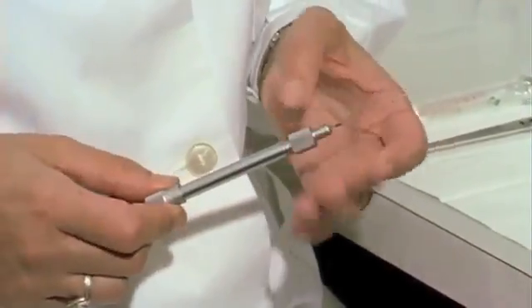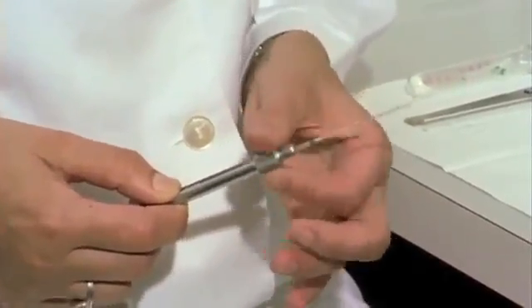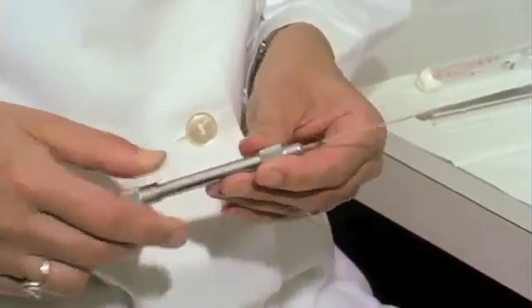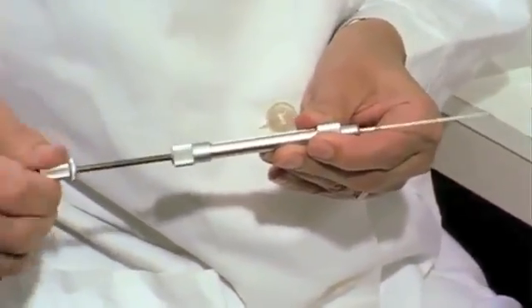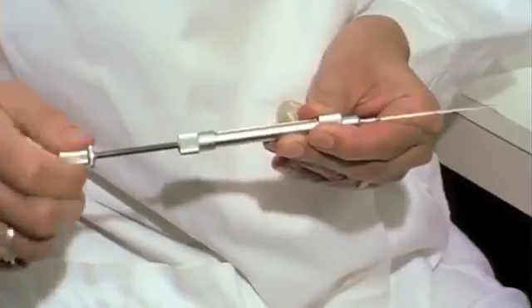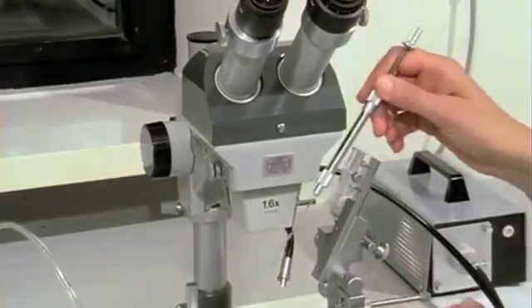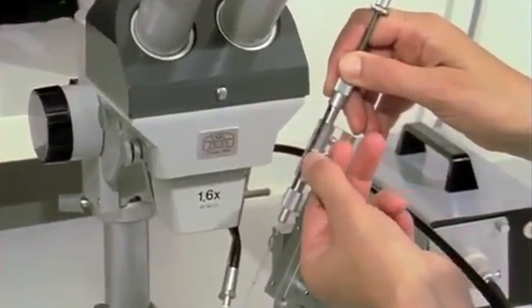The syringe is assembled and the column of liquid advanced to the front, save for a small bubble of air at the tip of the glass tube. Then the syringe is mounted on the insemination apparatus.